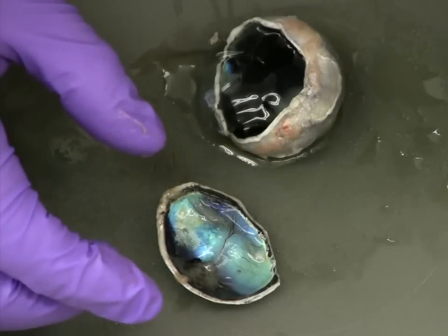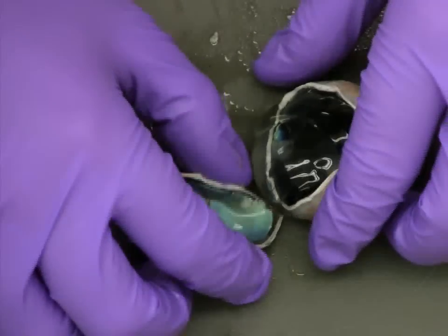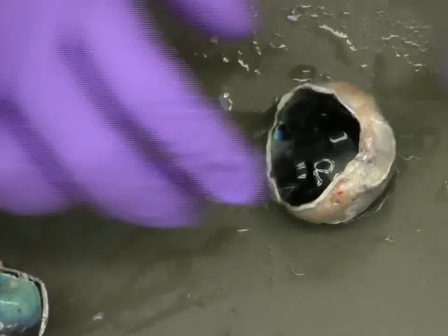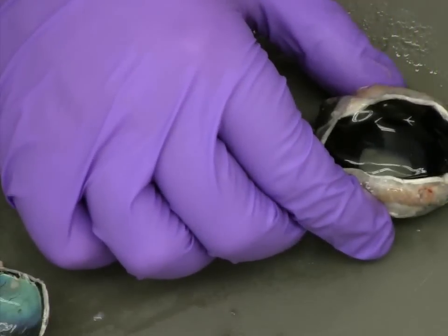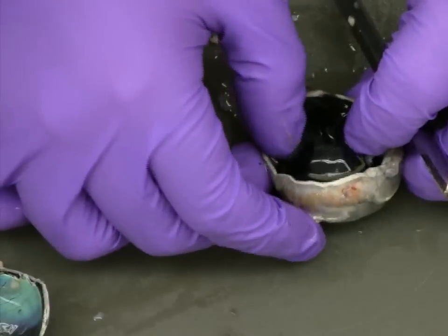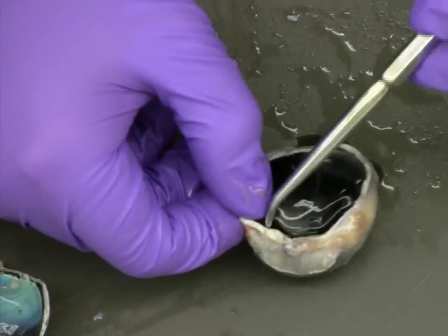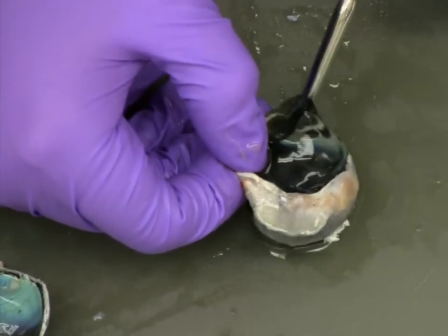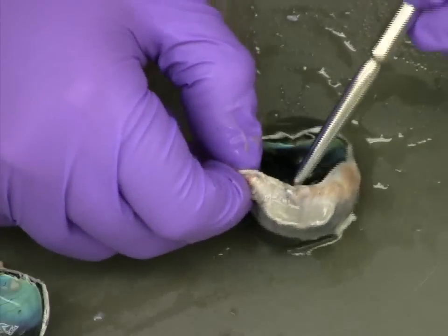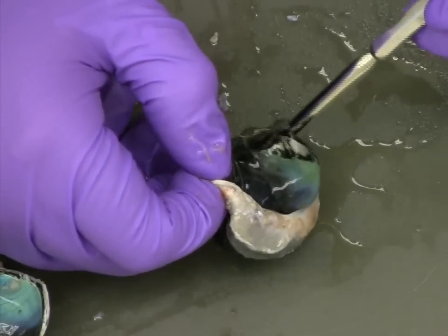In order to gain access to the lens, we need to remove the vitreous humor from the interior of the eye. To do this, we're going to use our blunt probe to carefully loosen the vitreous humor from the surrounding sclera. Much like preparing the outside of the eye, removing the vitreous humor in a fresh eye can be fairly time consuming, so we're going to speed up the process.